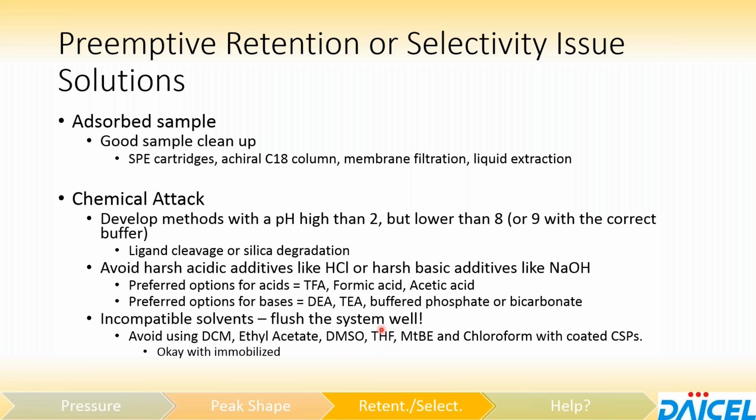well. In our case here in our lab, we actually have dedicated systems. We call them the extended range solvents. That would be hexane dichloromethane, hexane MTBE, things like that. That system never ever sees coated phases, just as a precaution so that there's never any chance whatsoever of those coated phases seeing these solvents.